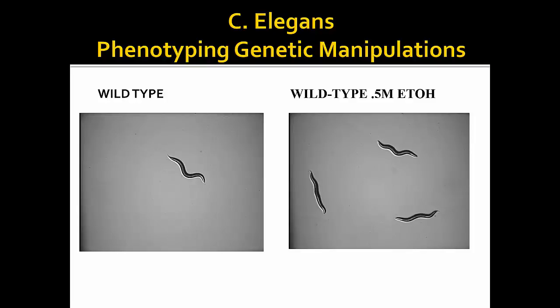So say you have these same animals, and now they're on ethanol. Ethanol has pretty much made them drunk. They can't make those deep bends. They can hardly make forward progression. They're not moving anywhere. Oh, that one, he's doing well. So it's kind of interesting.